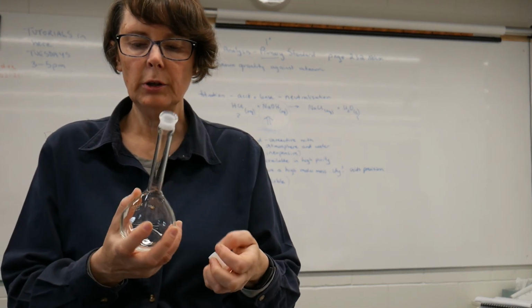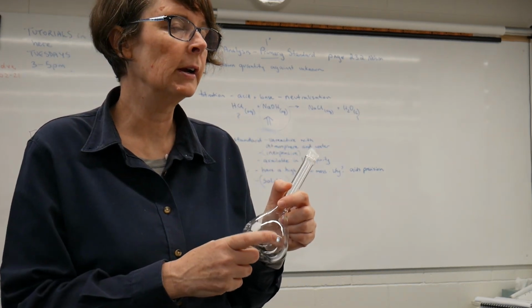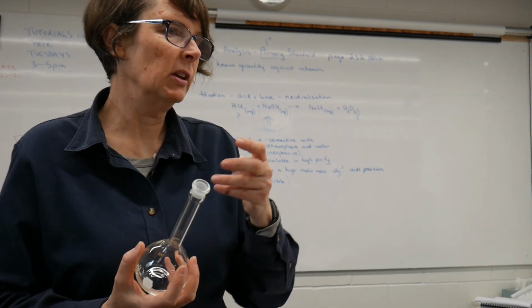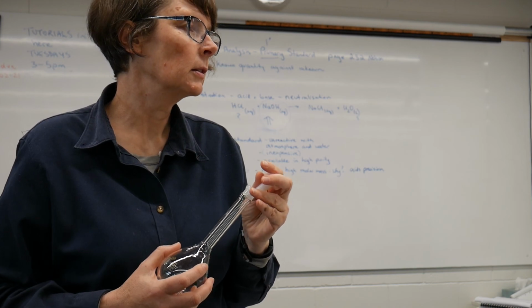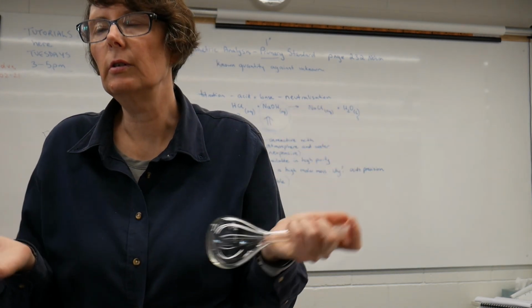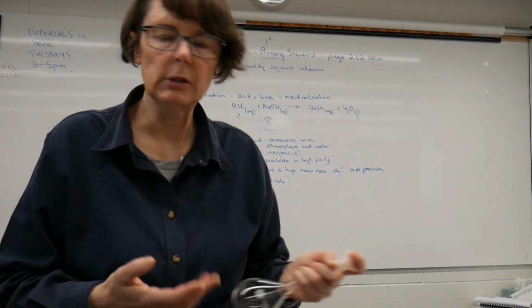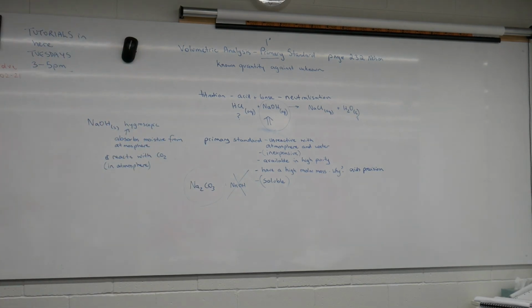You're going to need to label your solution for your pair ready for titrating on Wednesday, and we can put them on the shelves at the back there. It's not hazardous as well. I mean, that's a good thing too. The sodium hydroxide is certainly much more hazardous than the sodium carbonate, although it's very good for cleaning.